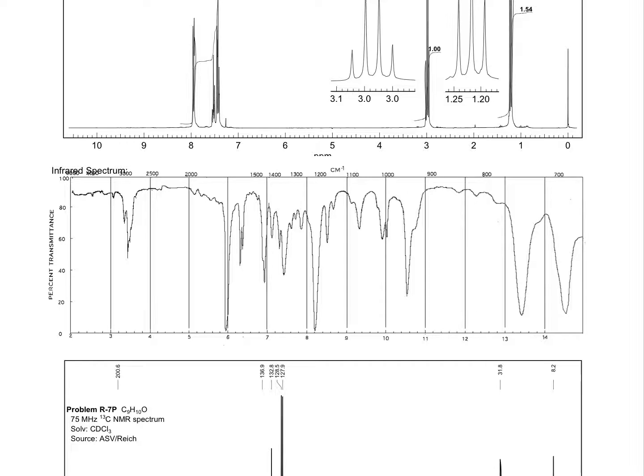So what do we see here? I think the 3000 is like carbon-to-carbon bonds. So we have some carbon hydrogen bonds. It's not entirely clear if it's beyond 3000 or not. So let's keep it an open view so far. So both sp2 and sp3 type CH bonds.